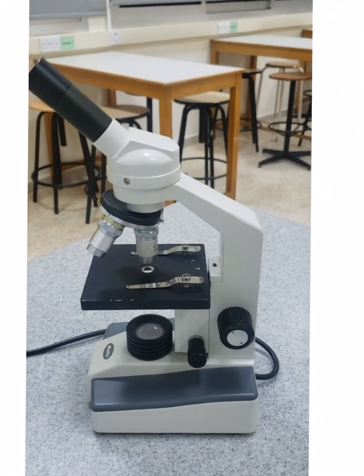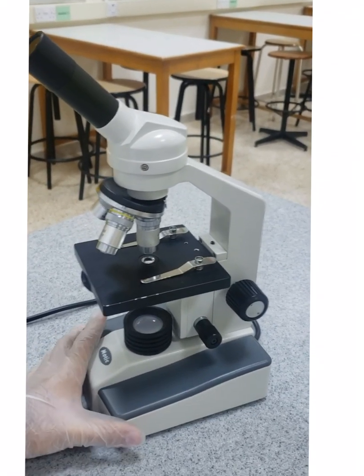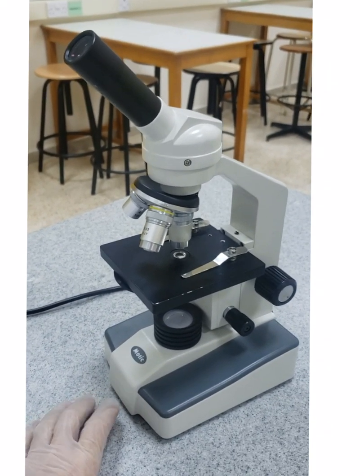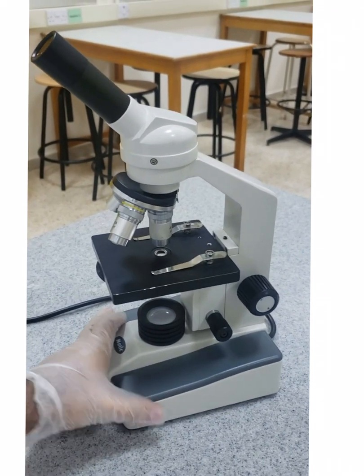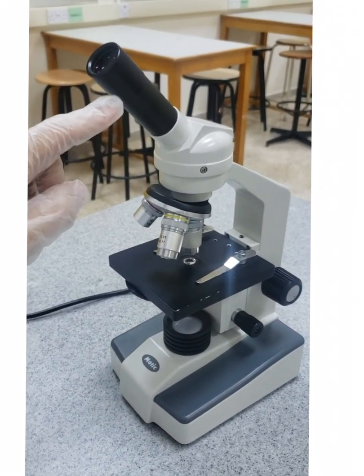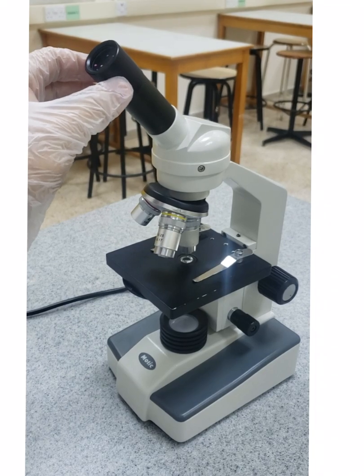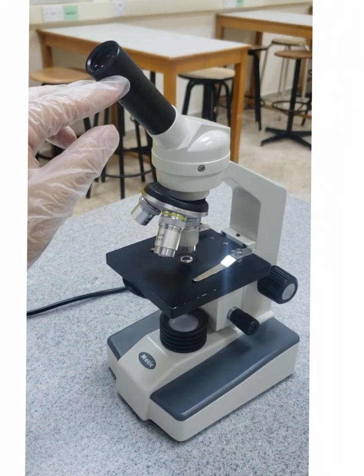This is the microscope. The microscope is an optical instrument used to observe very small objects that cannot be seen by the unaided eye. Let's talk a little bit about the parts of this microscope. Number one, we have here the eyepiece. I will put my eye here in order to observe through it. Inside this eyepiece, I have a magnifying lens with 10 times magnification.